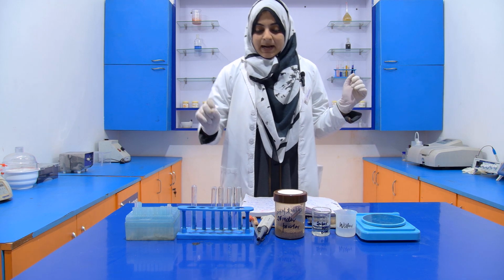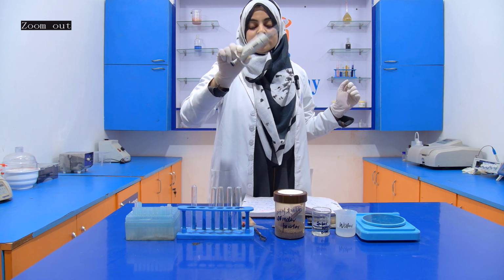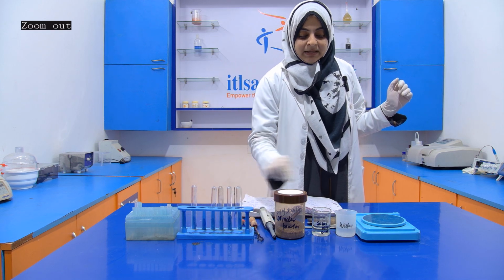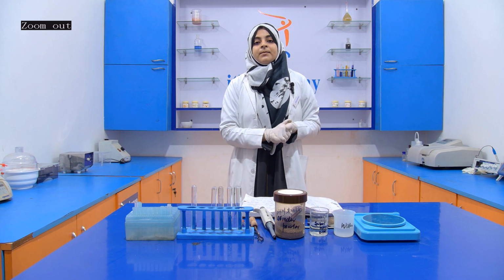Then we require a test tube stand, a micropipette of 1000 microliter or 1 ml, then a dropper, then water, and a weighing balance for weighing the coriander powder.